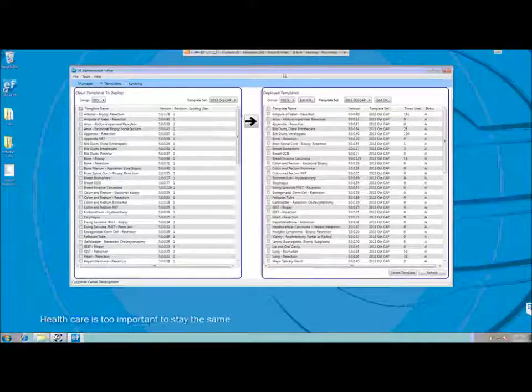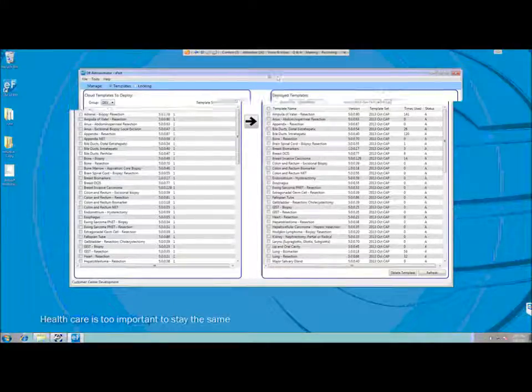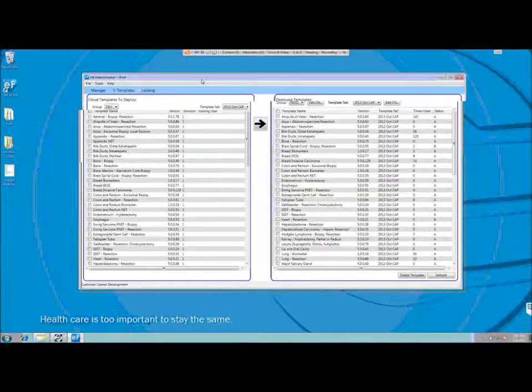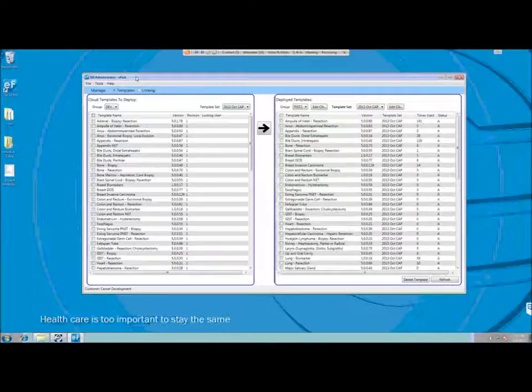So to start off, before you can start using worksheets within mTuitive, you have to first obviously know which ones you want to use, and you have to pull them in from the mTuitive Cloud service. So mTuitive provides this DB administrator tool that you're looking at, and this is basically how they distribute their existing content.